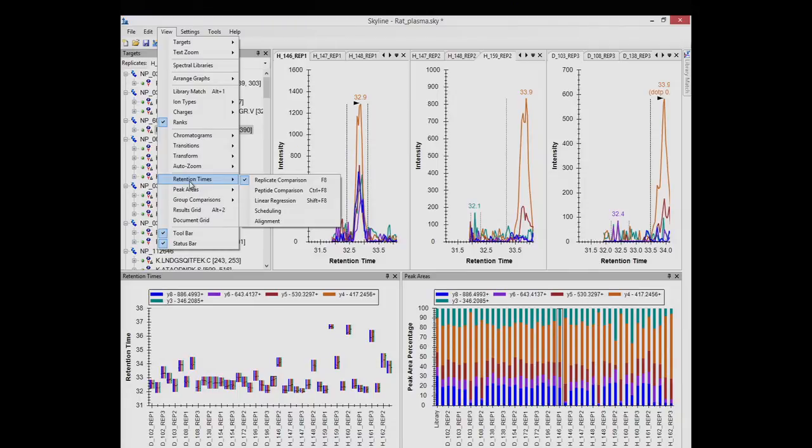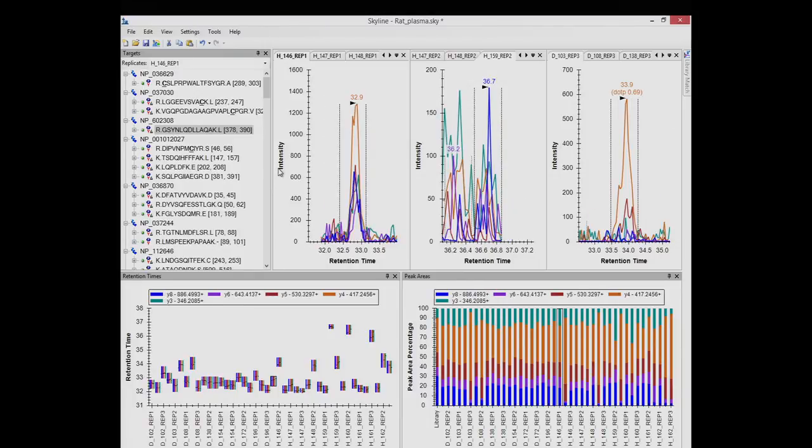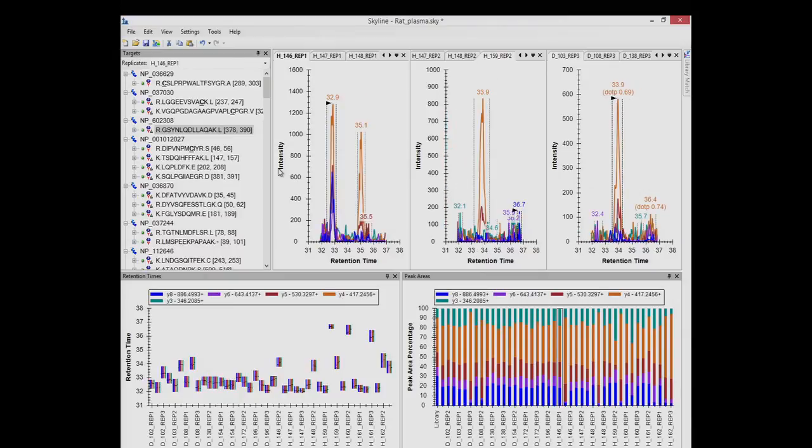Okay. So if you weren't seeing the peaks close up, sorry, I didn't start with a blank slate. Then you would want to go to auto zoom, and then auto zoom best peak. And now this is the most important keyboard command in Skyline. So there are keyboard shortcuts. You can auto zoom none, and then some of you probably were looking at views that look more like this if you were auto zoom none. Or you can auto zoom best peak. And the way to get back and forth is F11 to zoom in and shift F11 to zoom out. And that's pretty useful.